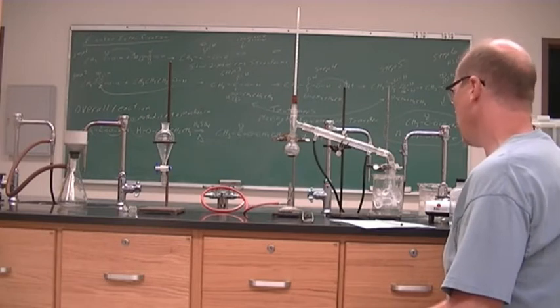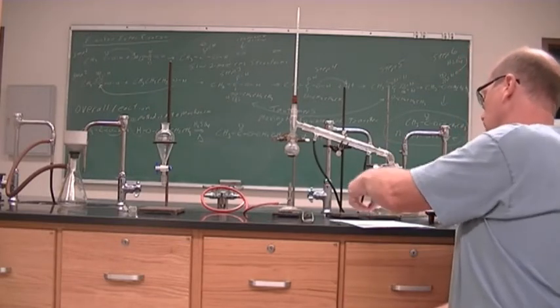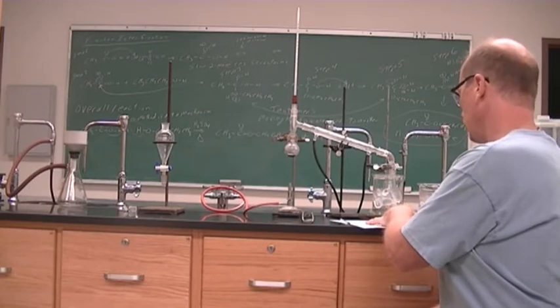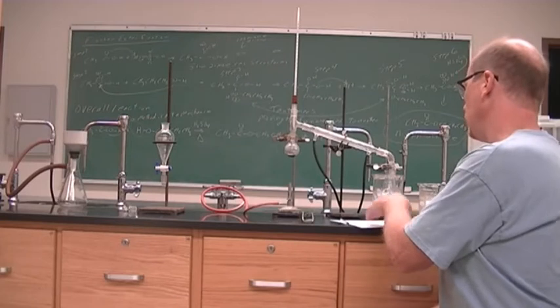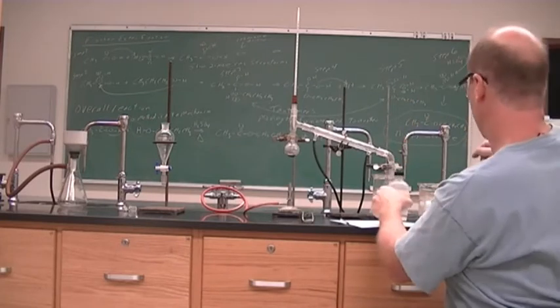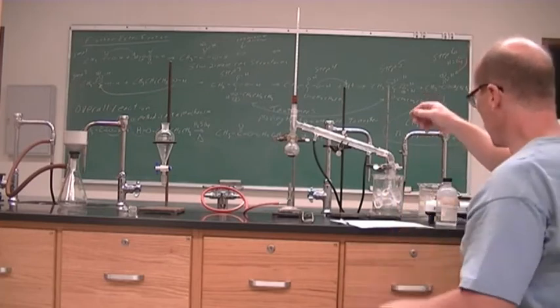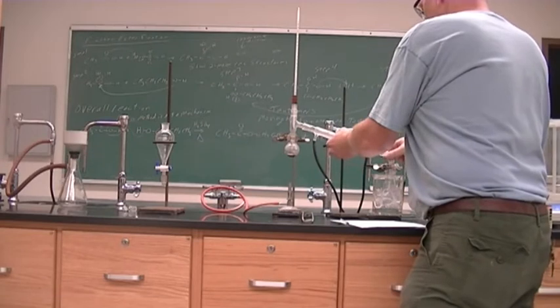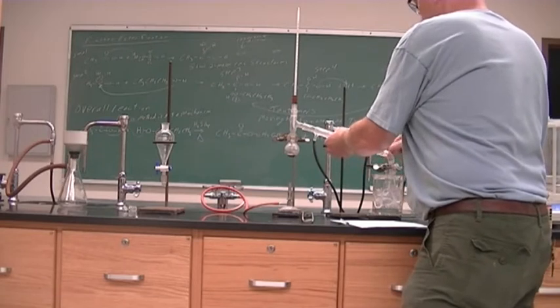Once we have neutralized our acid, we are going to then transfer that to the separatory funnel and get our product separated from our aqueous layer.